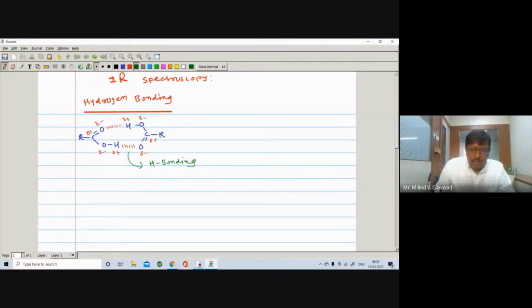Now, how will this hydrogen bonding affect the vibrational frequency?